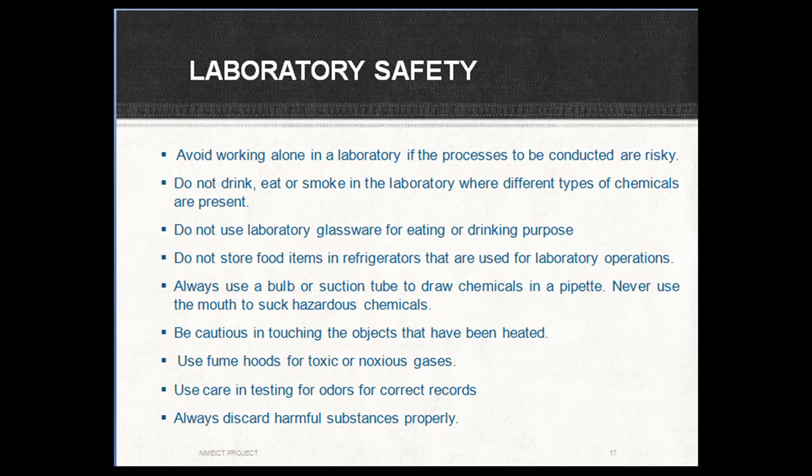Always use a bulb or suction tube to draw chemicals in a pipette. Be careful in touching the objects that have been heated. Always fire polish the ends of newly cut glass. Use fume hoods for toxic or noxious gases. Use care in testing for odors for correct records. Always discard harmful substances properly.